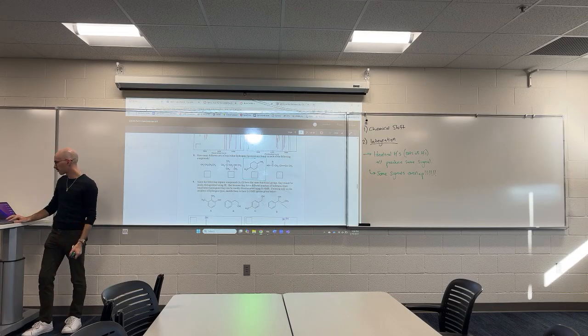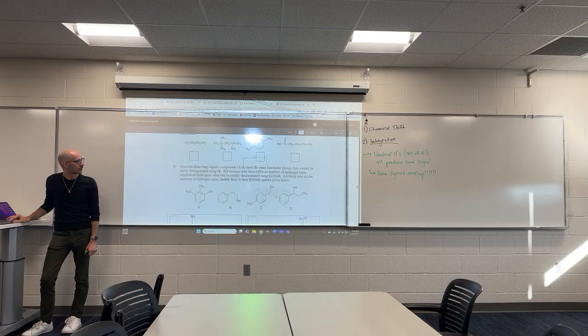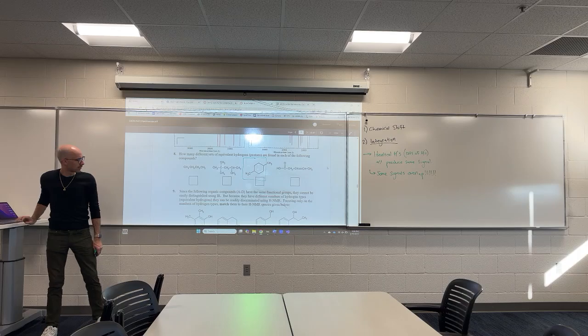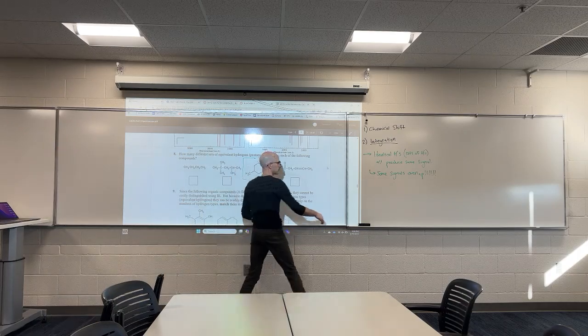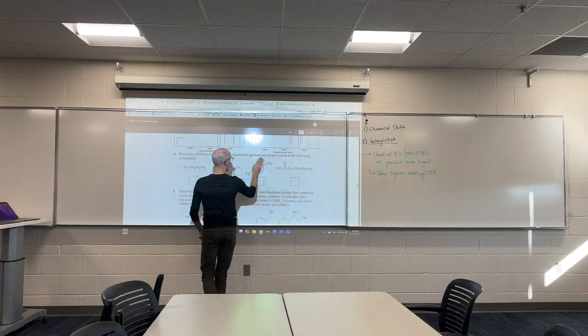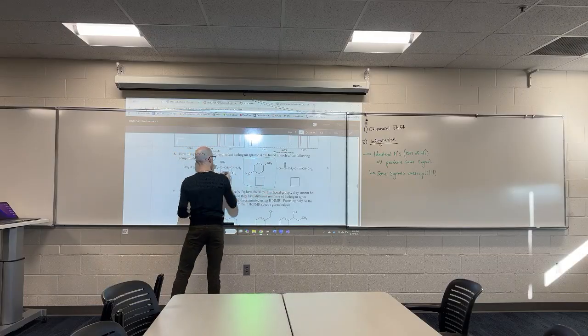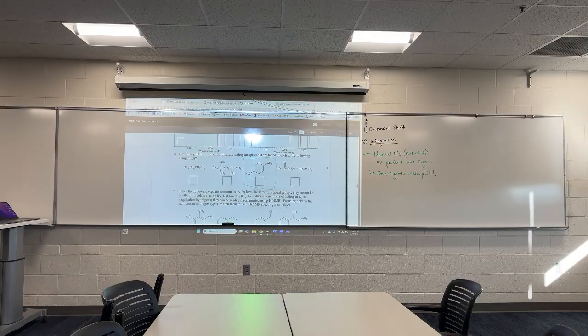I'll zoom in on it so we can see it a little bit more clearly. Feel free to discuss with each other.